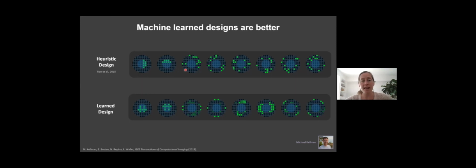And then for the dark field, we just randomly chose 8 LEDs at a time. So we could take 8 times fewer images. And since there's 8 LEDs at a time, each image is 8 times brighter. So we got about a factor of 100 improvement in speed, which is what we needed to be able to do live samples. But then we started getting into this end-to-end design that I talked about before. And now we're just trying to apply it to everything we possibly can. And so we applied it to this problem of choosing the LED patterns.